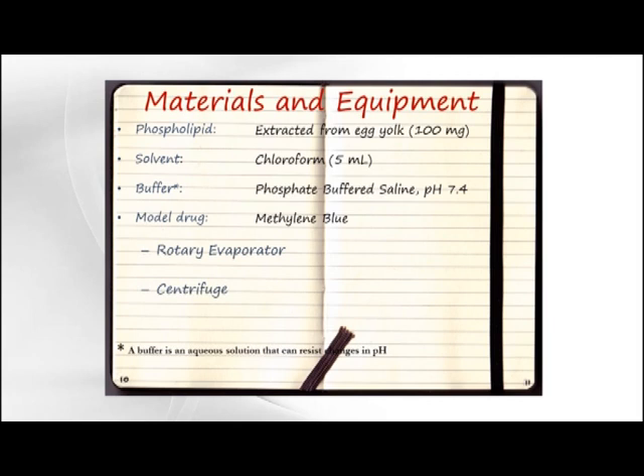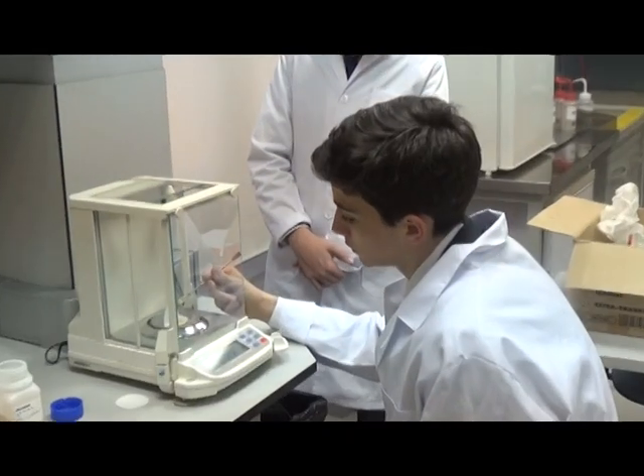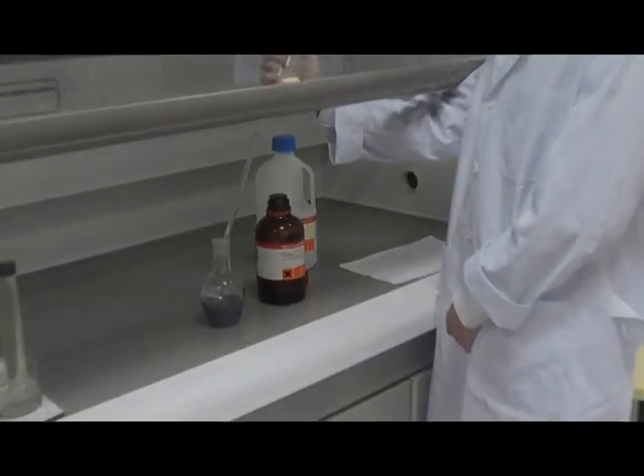In this experiment, we will be making liposomes using phospholipid extracted from egg yolk. Here are the materials and equipment we are going to use. First, we weigh out the phospholipid and dissolve it in chloroform.